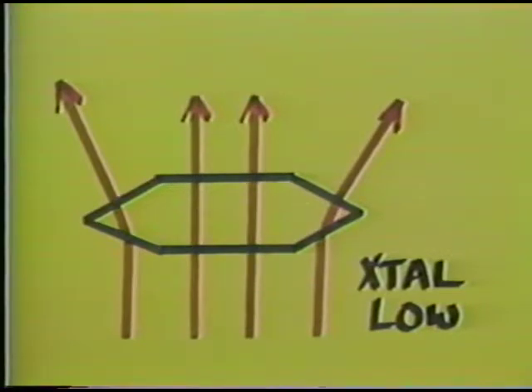It's a very idealized form, but the important thing about it is that most of the time when you look at mineral grains, they are thinner at the edge than they are in the center. And as long as that's true, and that's true for nearly all grains, then the Becke line test will work. And so what happens is I'm showing the direction of propagation of light, which goes this way through the crystal, and in the central part of this crystal, if the top of the crystal is flat and the bottom is flat, then light goes directly through it.